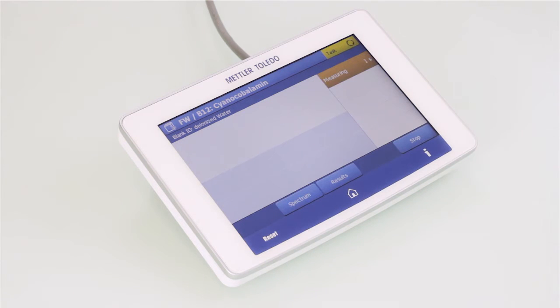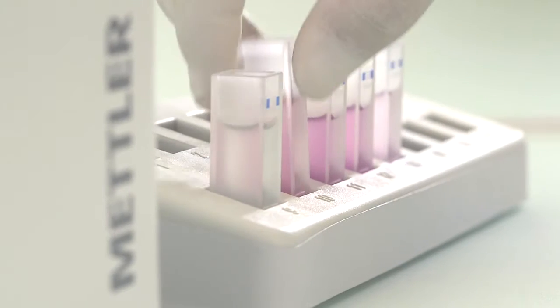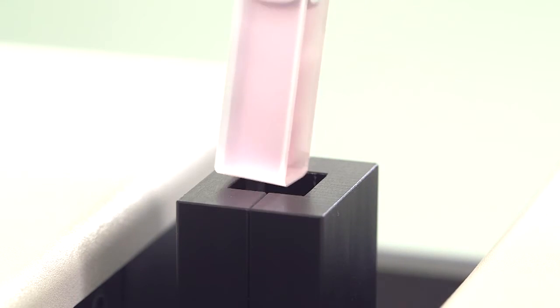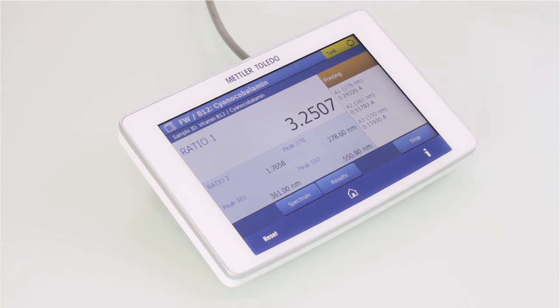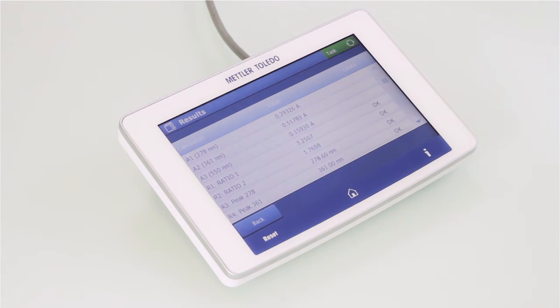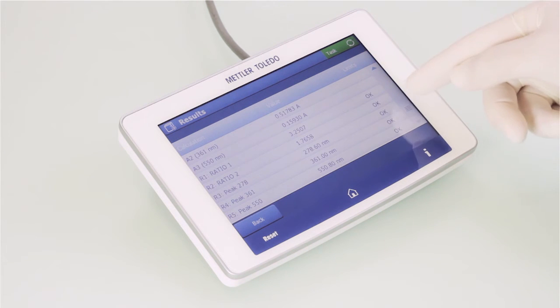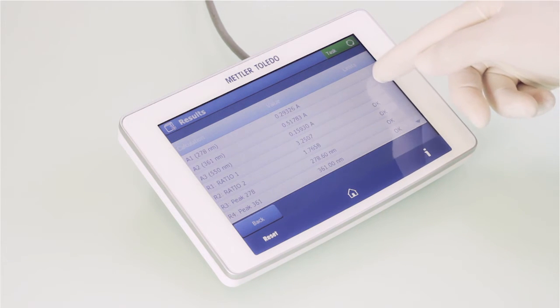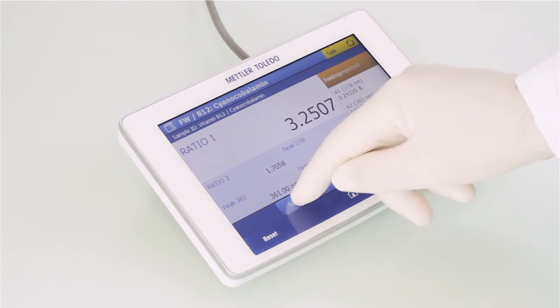During the measurement, the user is guided step-by-step throughout the process. All results are displayed immediately after the measurement. All important results for the identification of vitamin B12 are presented at one site, including the peak identification and ratios.